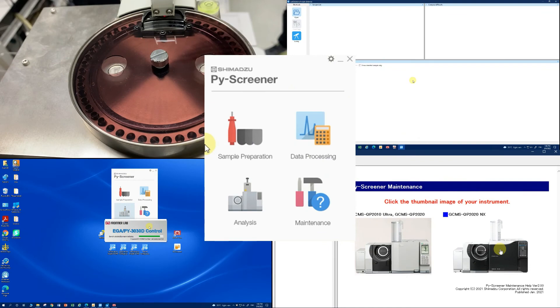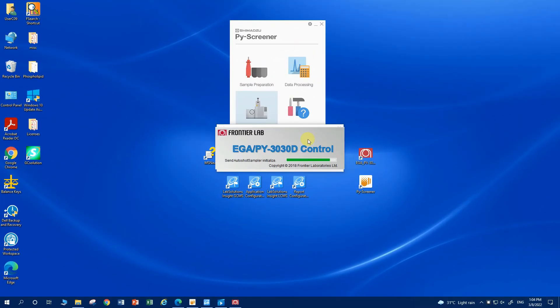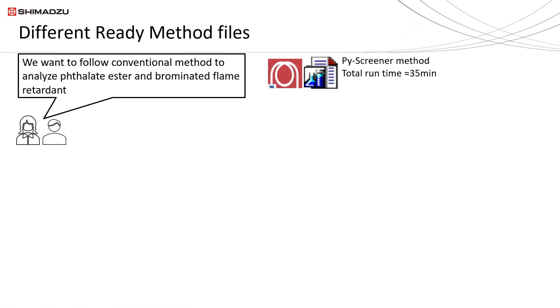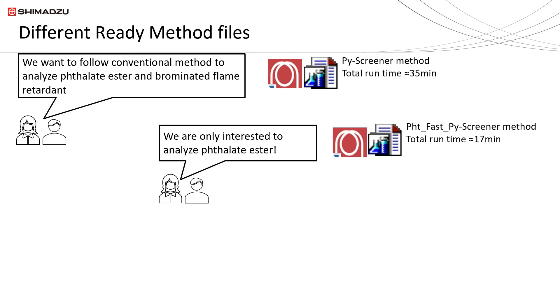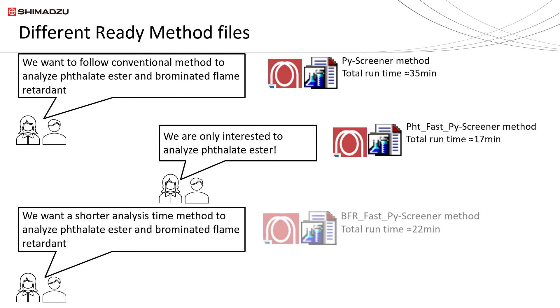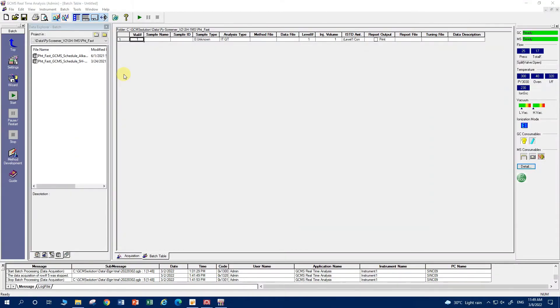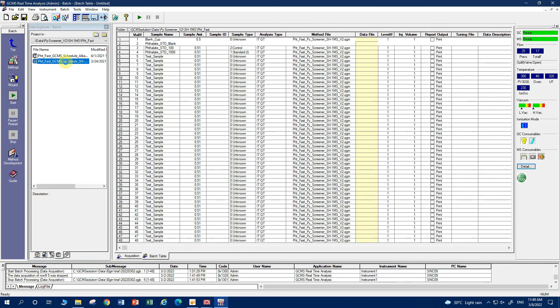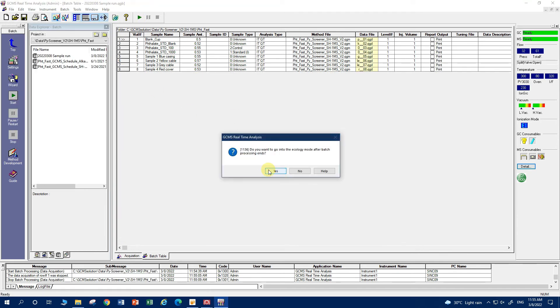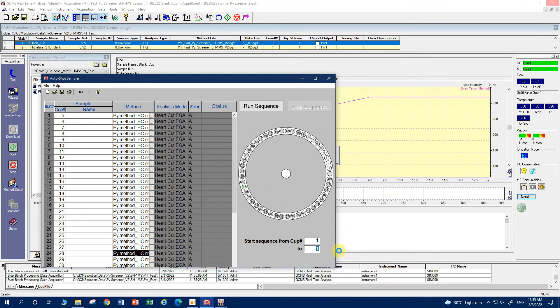To start sample analysis, simply click on the analysis icon in the PY Screener program. It will load the required software to control the system. Multiple ready method files for different user requirements were provided when the user installed PY Screener. One of the methods screens for seven phthalate esters and brominated flame retardants, with total run time reduced by almost 40 percent compared to the conventional method. The only thing users need to do is load the batch table template, key in their sample information, delete away unwanted rows, save the batch table, then start both the GC-MS and pyrolyzer batch tables to start the run.